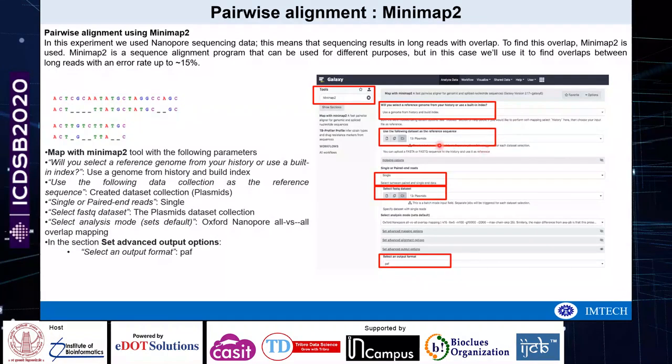And then again you will use your particular folder in which you have your samples. They are single reads, so we have selected that.